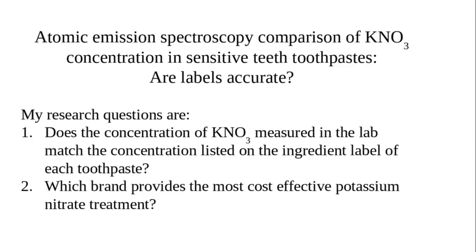Therefore, I measured the concentration of potassium nitrate in 3 different toothpastes marketed for the treatment of sensitive teeth that contain potassium nitrate. I used atomic emission spectroscopy to detect potassium at Robert Morris University. My research question is, does the concentration of potassium nitrate measured in the lab match the concentration listed on the ingredient label of each toothpaste? Which brand provides the most cost-effective potassium nitrate treatment?